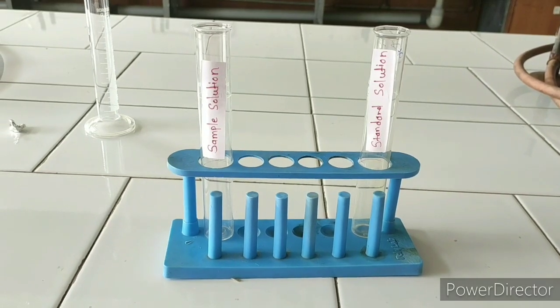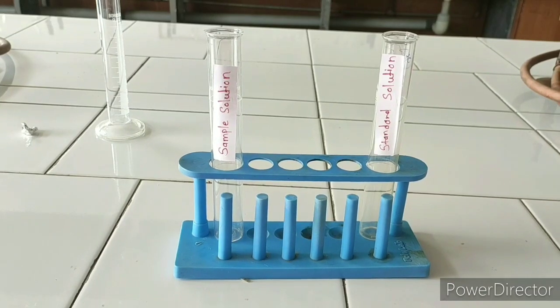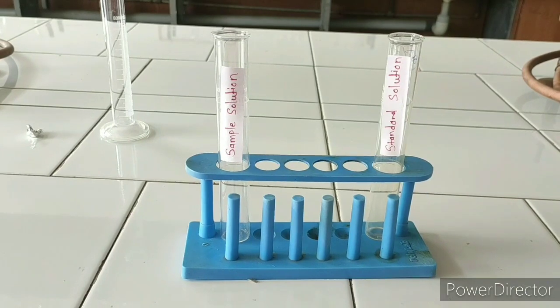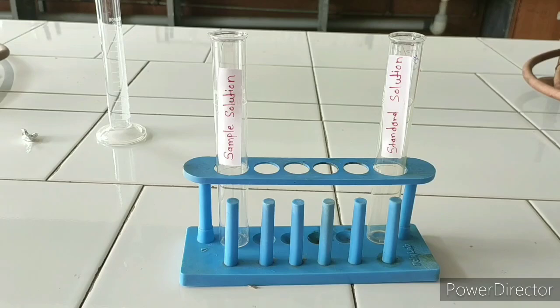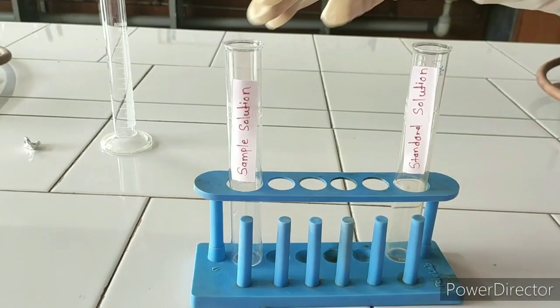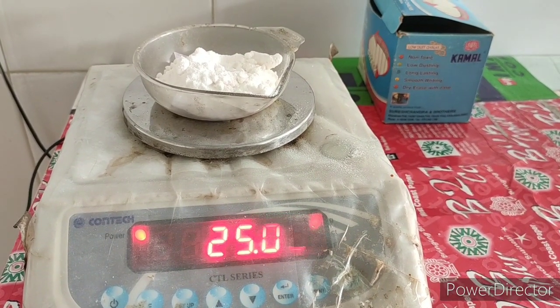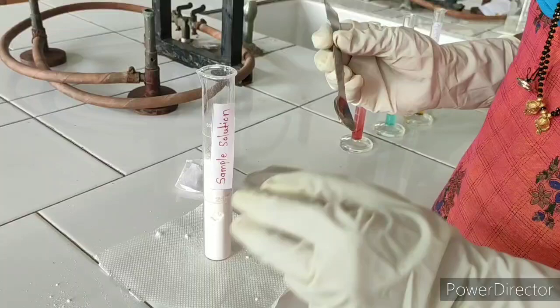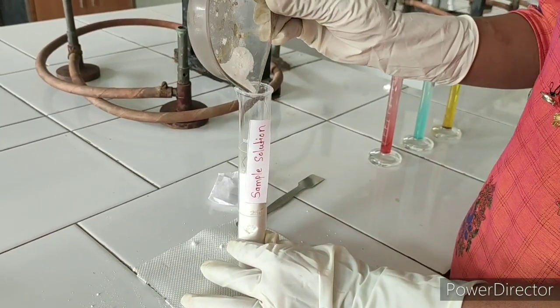We will start the stepwise procedure. Take a pair of Nestler cylinders. In one of them, prepare a solution of dextrose by dissolving 25 grams of dextrose in purified water up to the mark of 50 ml — that is the sample solution. Take the weighed quantity of dextrose anhydrous, i.e. 25 grams accurately. Add 25 grams of dextrose anhydrous into the Nestler cylinder.